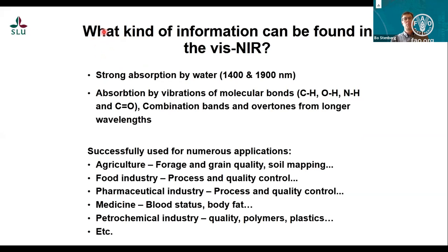So what kind of information can be found in the visible near infrared? Well, I gave you the example of water, and that's not a coincidence, because water absorbs very strongly in the near infrared, especially at 1400 and 1900 nanometers. But there is also absorption by vibration of molecular bonds between a large and a small atom, like carbon to hydrogen, oxygen to hydrogen, nitrogen to hydrogen. And as you can understand, we see from that it's organic molecules.